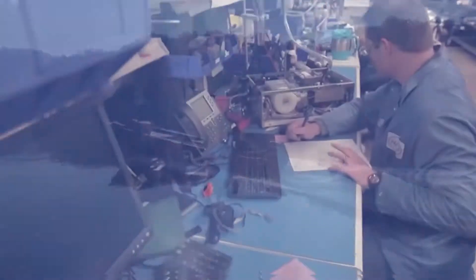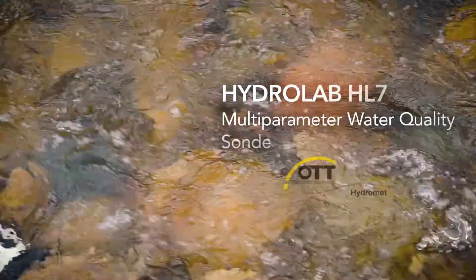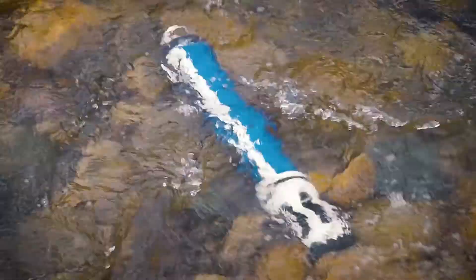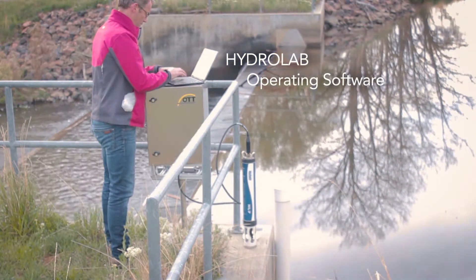With almost 50 years of experience and proven technology, accompanied by world-class customer service, we introduce the HL7 as the newest model in the HydroLab HL series with intuitive guided software for unmatched usability.